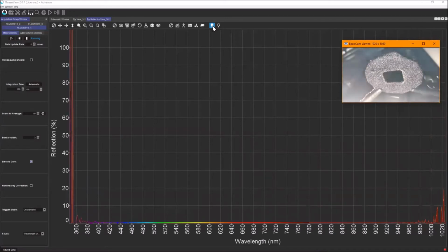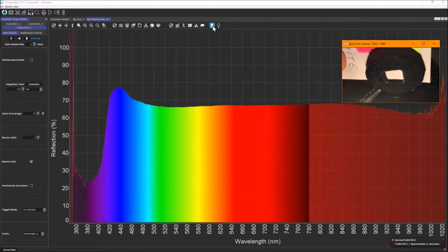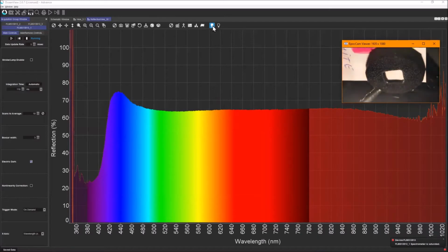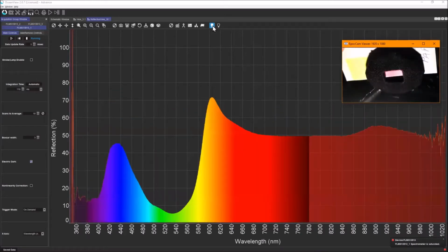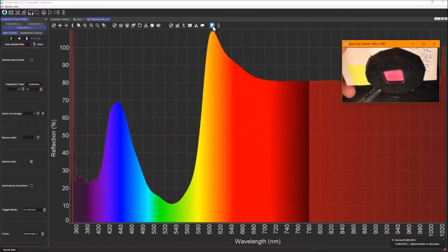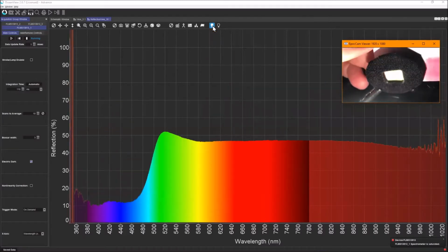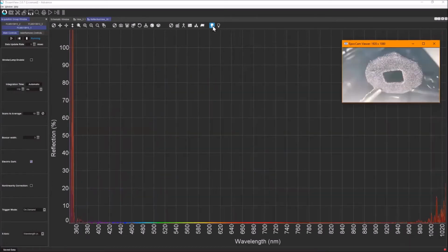Last piece will be white paper. This is white paper. Interesting peak in the blue. This is white paper with a pink marker. Interesting peaks. And this is white paper with a yellow marker. Now let's do the second group, fluorescence, which will be followed by the third group, phosphorescence.